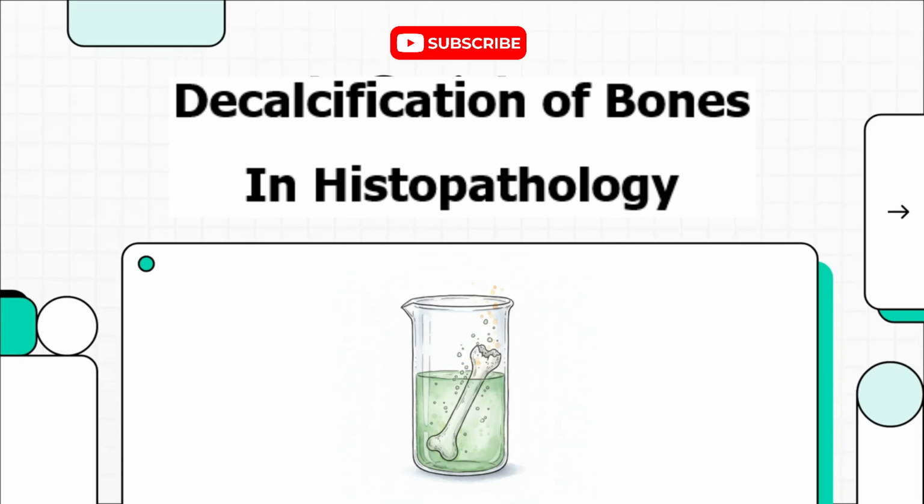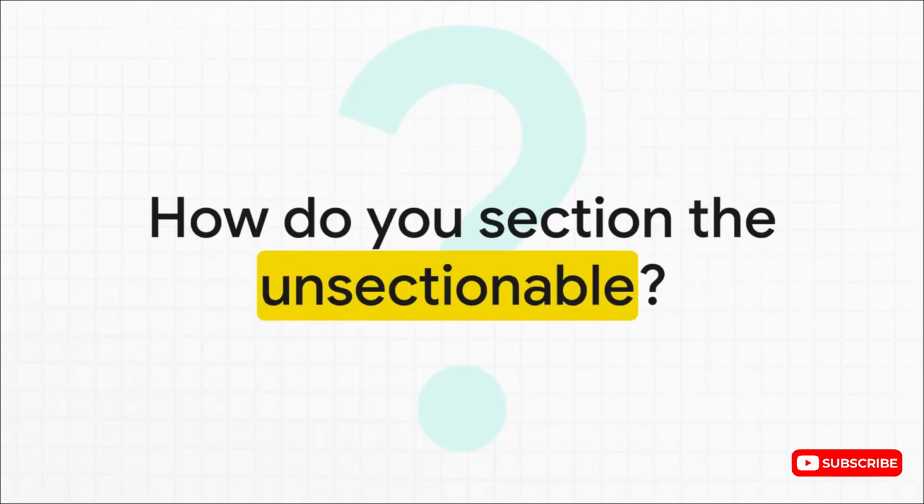All right, today we're going to dive into a really fundamental challenge in histopathology. We're talking about how you get a clean, beautiful, readable slide from something as tough as a piece of bone. And to do that, we have to master a truly essential technique, decalcification. So here's the big question, right?